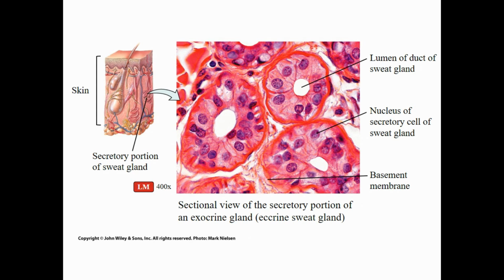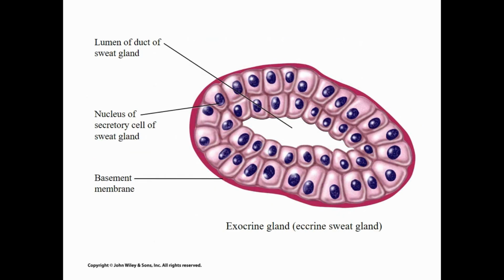And we move on to the sweat gland. So we're talking about the tissue that's in here. And we see one row of nuclei here, but this is kind of jumbled up, and it kind of looks as though there's multiple. So the real picture of this one is tricky, but in reality, there are multiple layers. So we're going to go with this being stratified cuboidal.